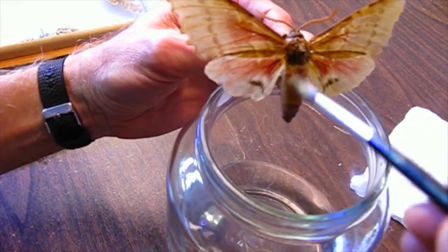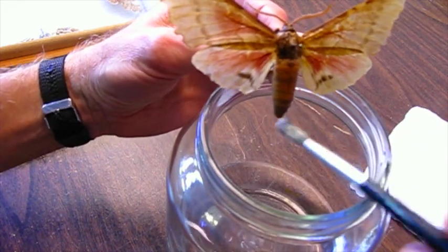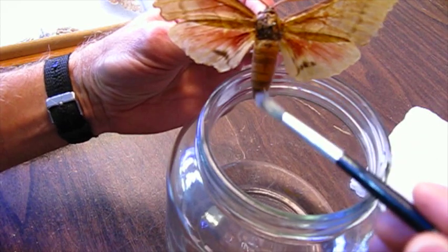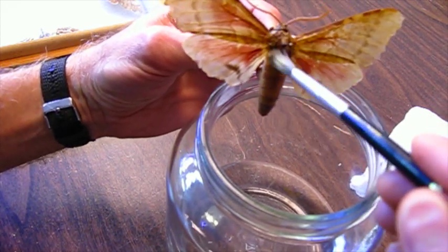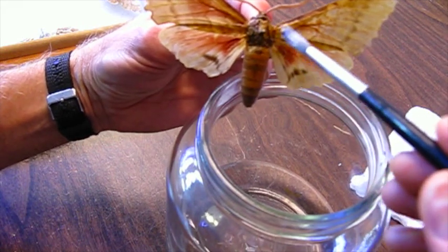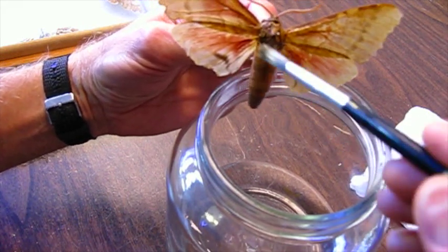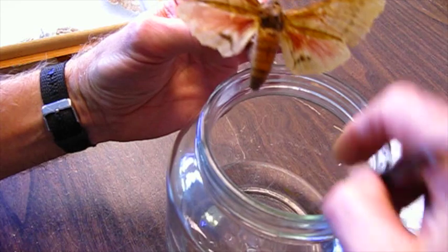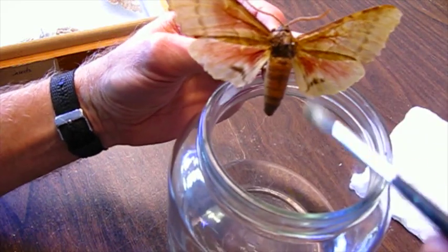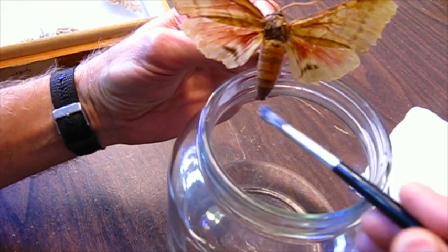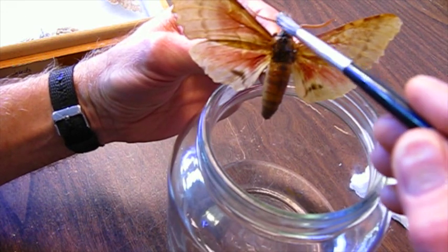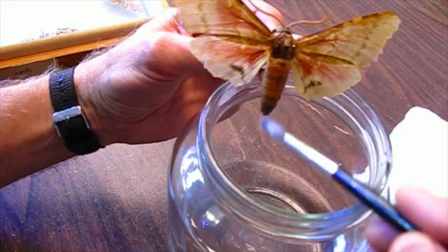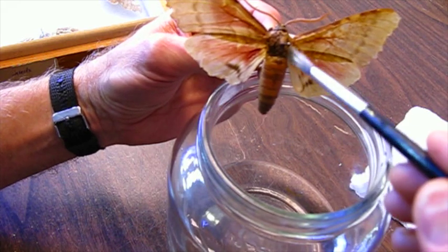This is going to mat the hairs, and once the specimen is dry we can fluff them up a little bit. It's not ideal, but it's certainly better than tossing the specimen. If you didn't treat it, it would continue to grow mold fuzz and contaminate the other specimens in the collection.